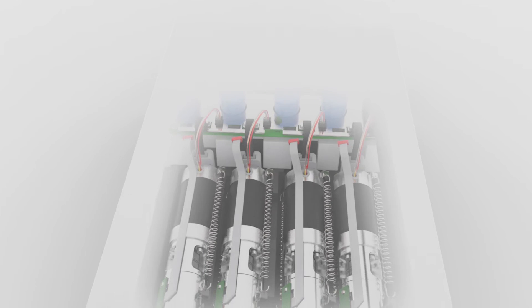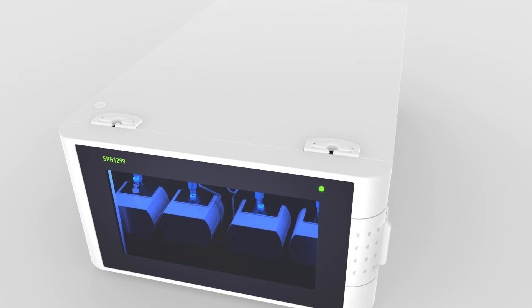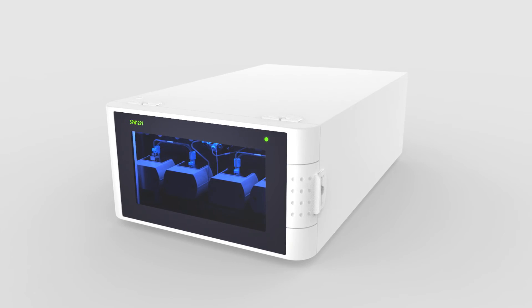Zero chance for trapped air means stable flow rates, robust chromatography and, finally, results you can rely on. A reliable, state-of-the-art UHPLC pump that'll turn many users into friends.